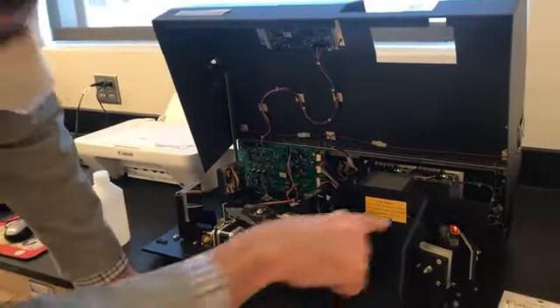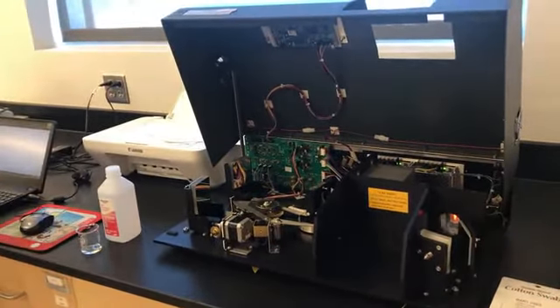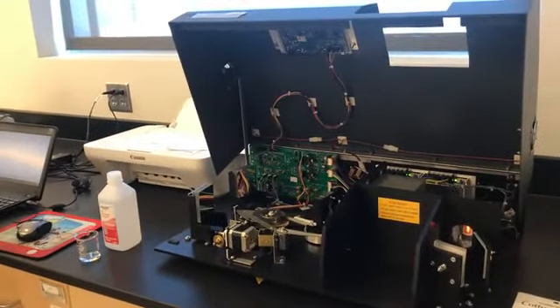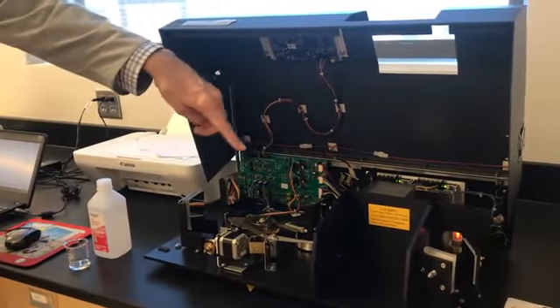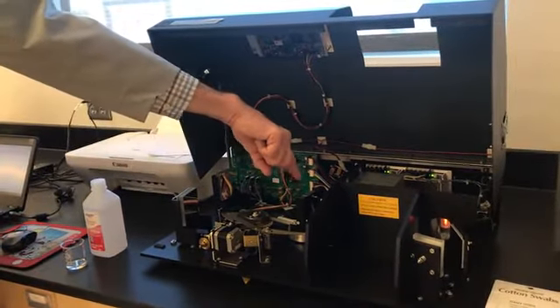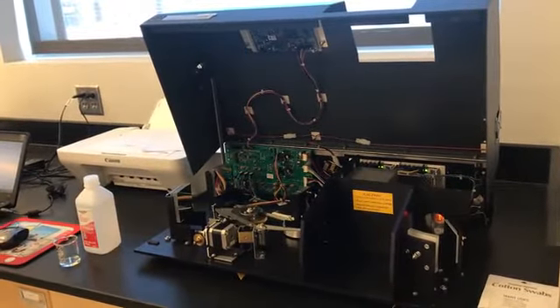If you look back through this window, you can see kind of a red glowing object. That is our infrared source, and this is the glow bar. It's a source of infrared energy. The monochromator that we use to select the wavelength, this is the monochromator. So this is the diffraction grating right here that disperses the energy.